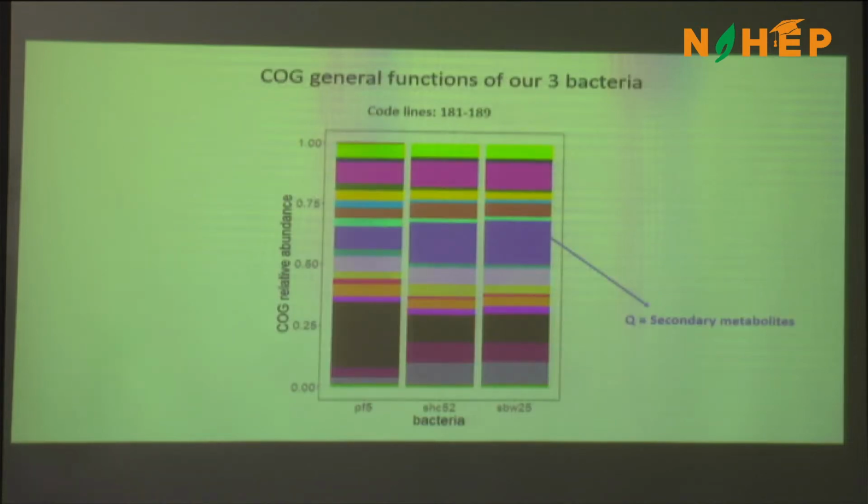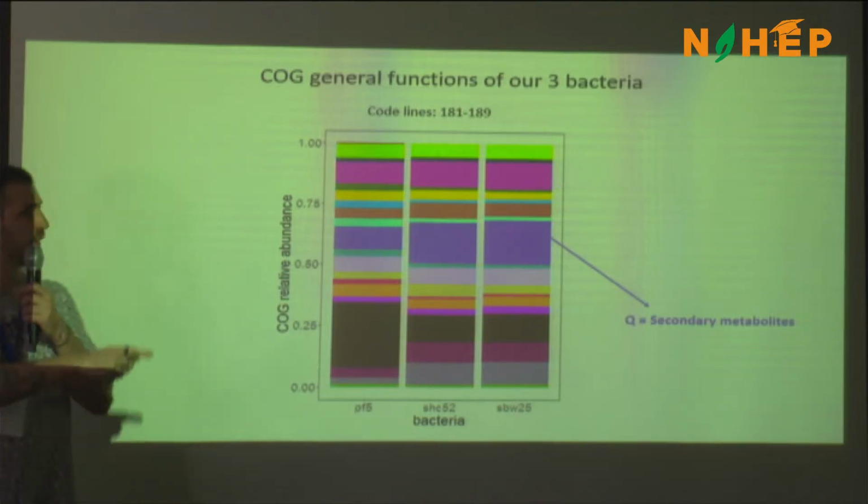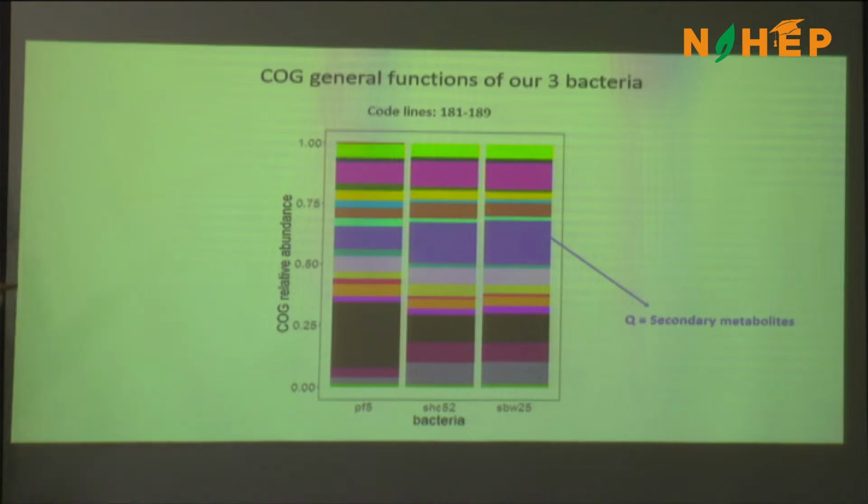Also, sorry, before I forget: if you go in RStudio, in the R file, to code lines 181 to 189, and you press play, you will generate this plot. So let's try, and please say if you have any problem.